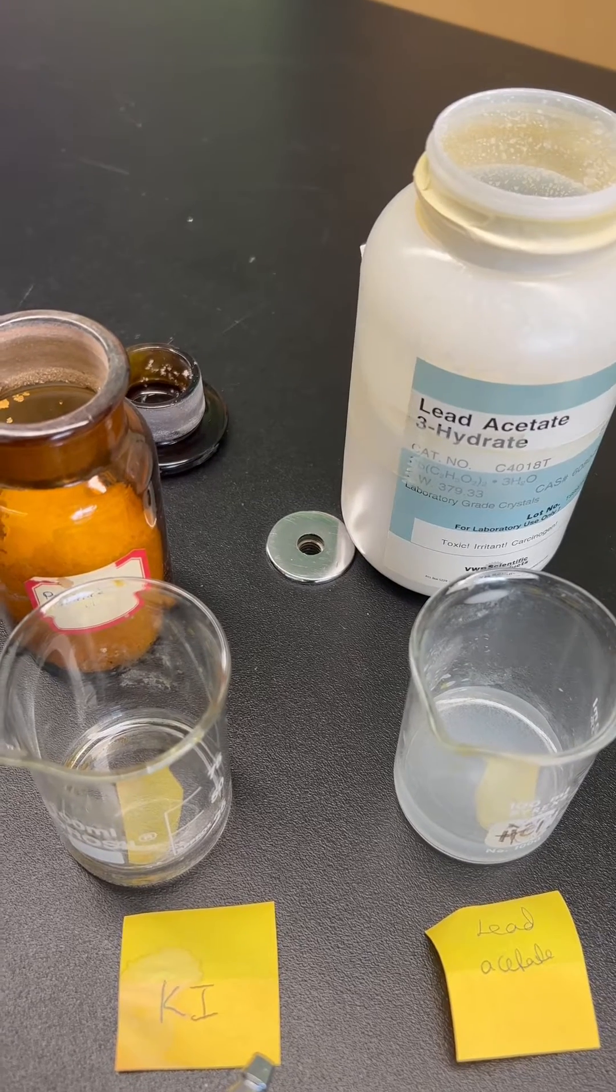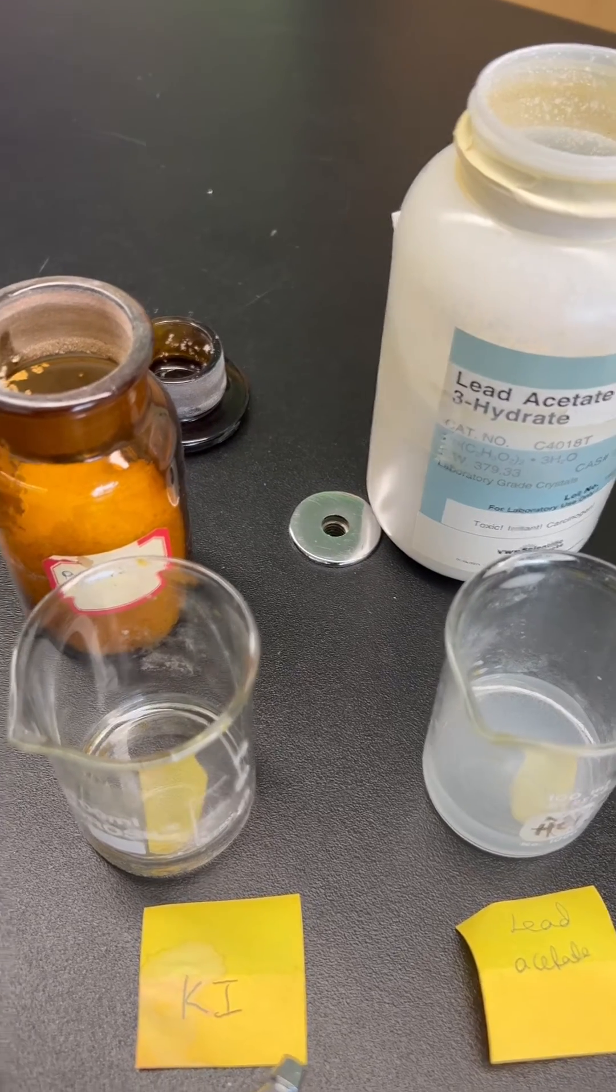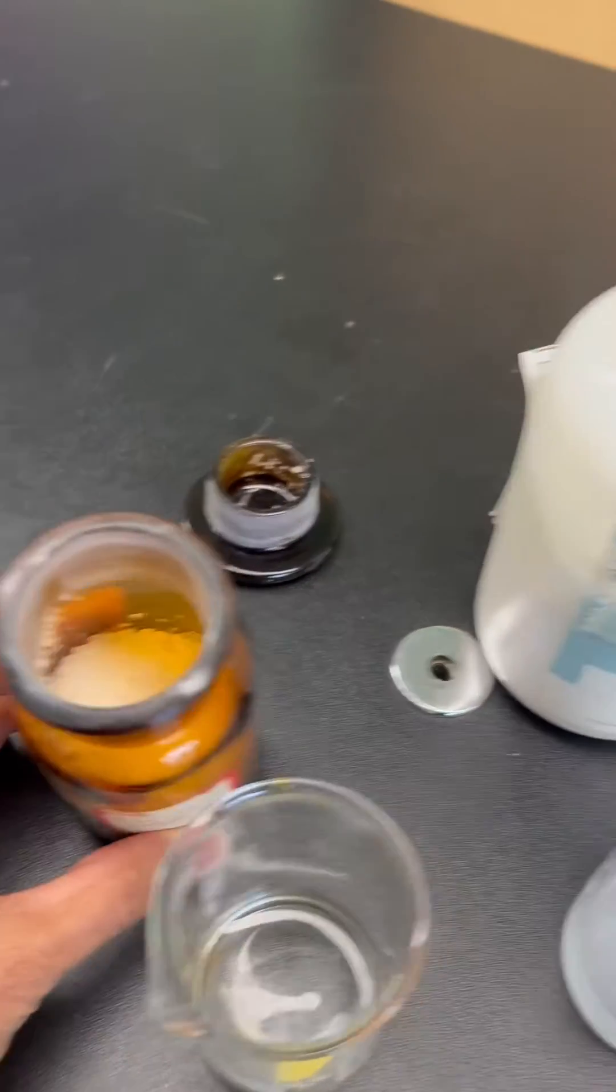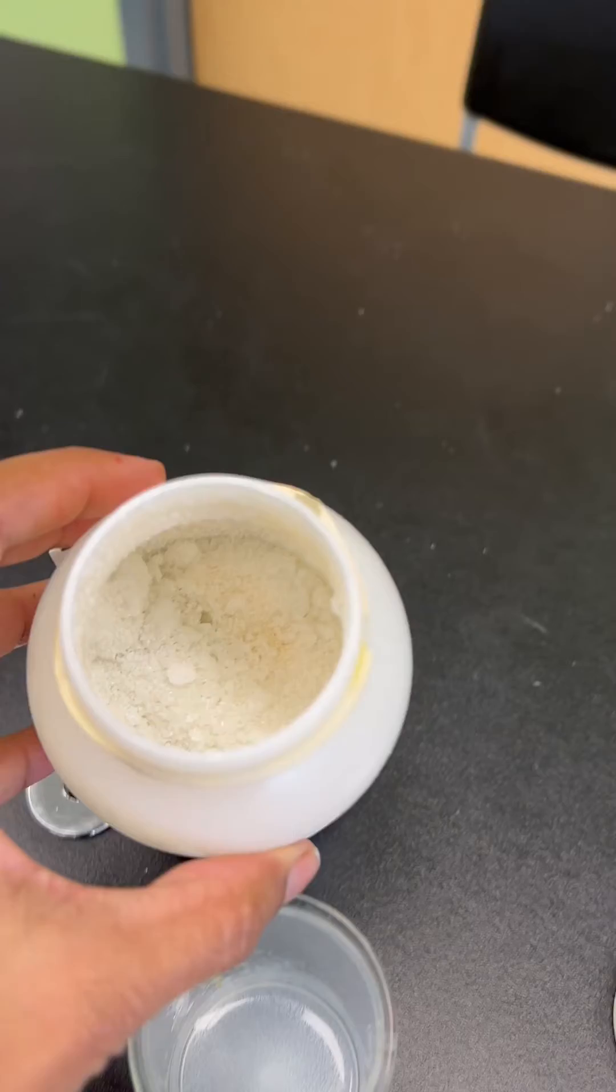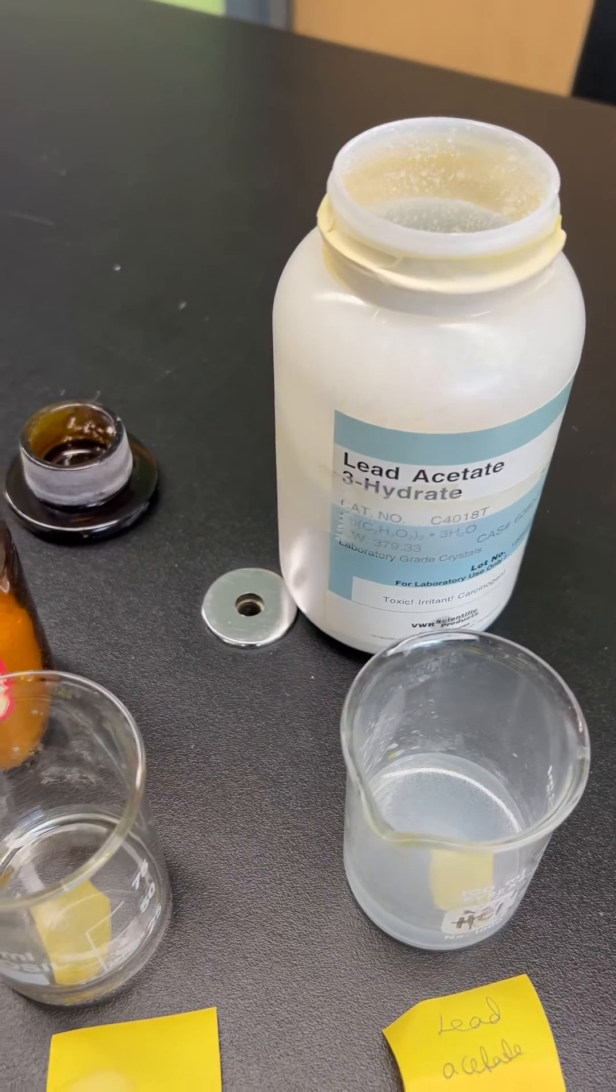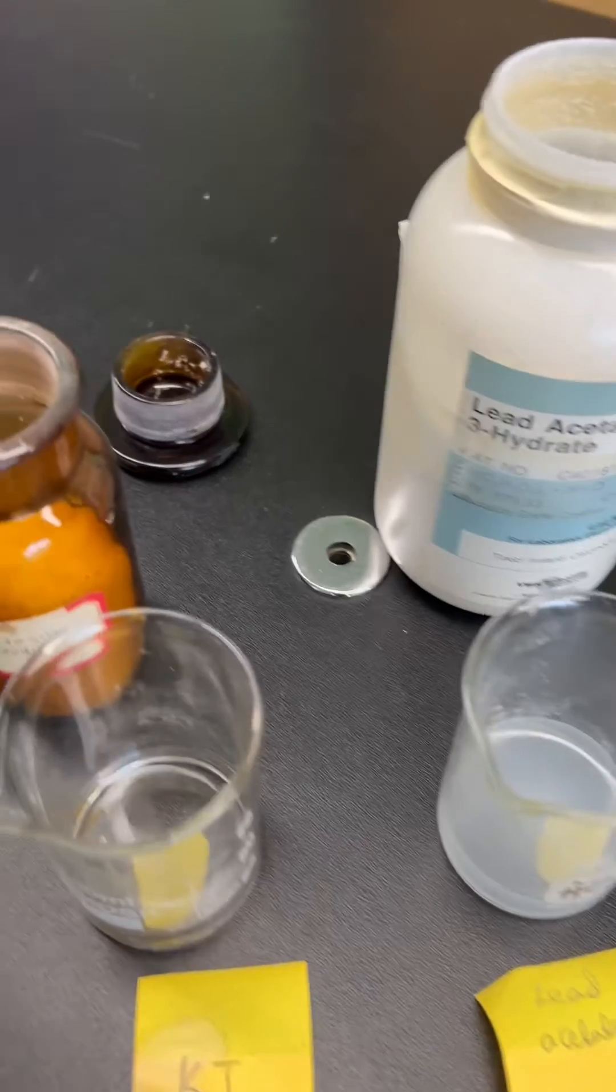Hi guys, so today we are going to do a double displacement reaction. I'm using potassium iodide, which is a white crystalline solid, and lead acetate, which is also a white crystalline solid. You can also use lead nitrate.